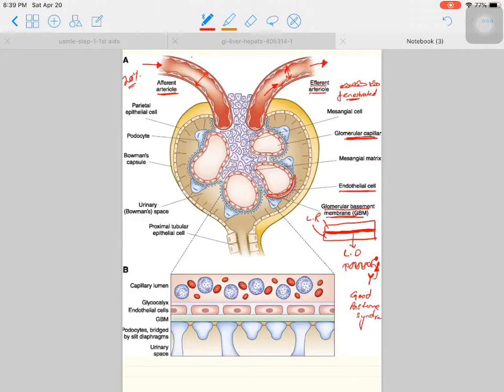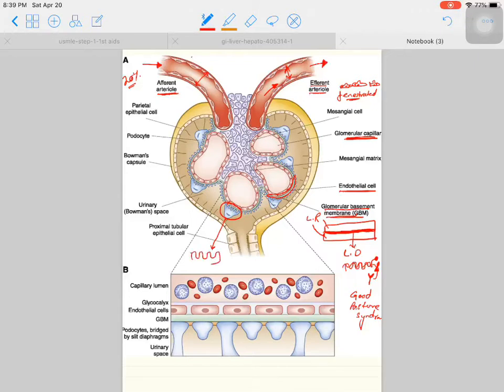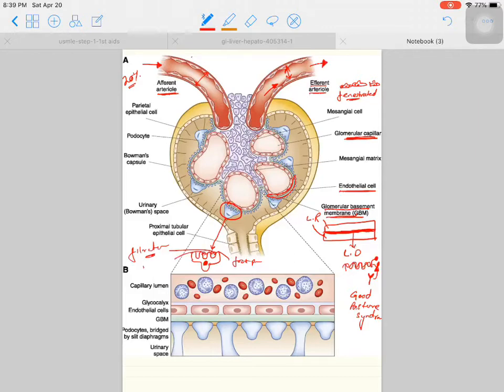Above the basement membrane there are special types of squamous cells called podocytes. The podocyte has a nucleus and foot processes. Between the foot processes there is a gap called the filtration slit, and there is a membrane across this slit called nephrin, which helps in ultrafiltration.